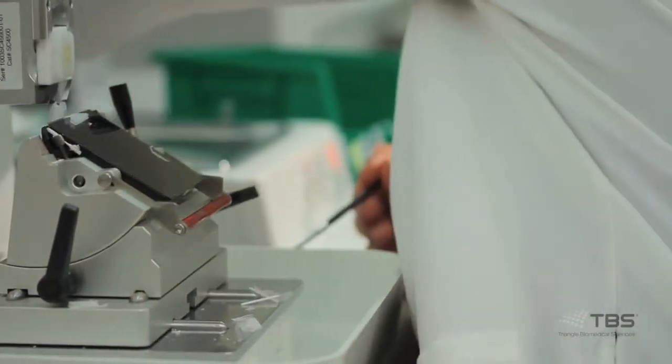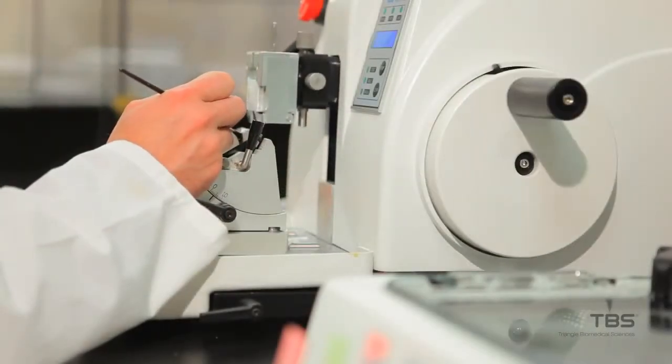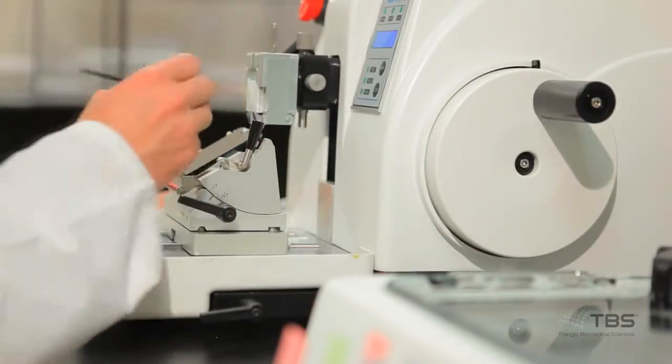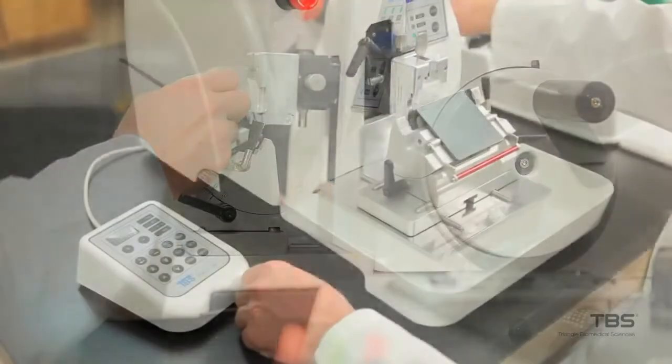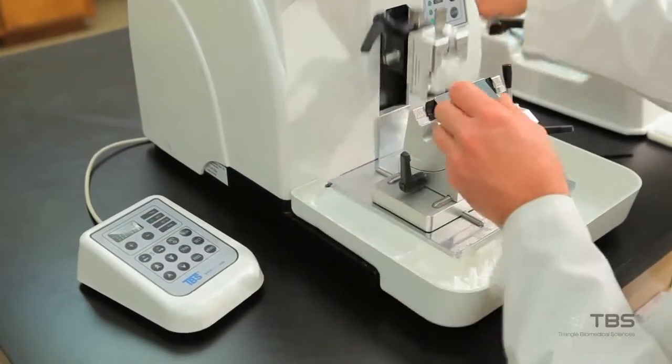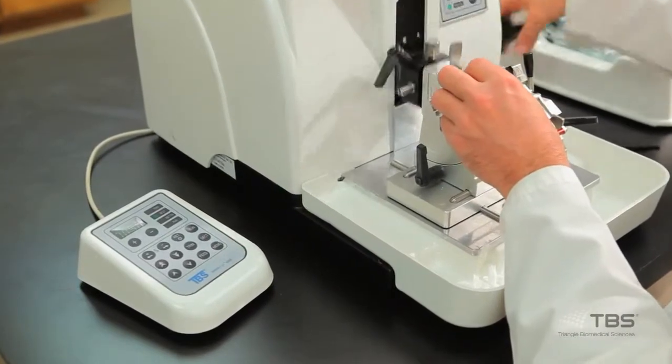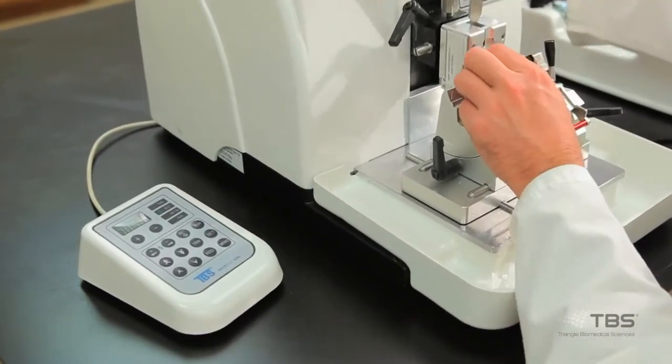This leaves the operator's hands free to manipulate and guide the ribbons. Switching between manual, continuous, and single-stroke cutting modes is managed by an intuitive handpad that also provides control of start-stop functions and easy switchover between preset trimming and sectioning modes.